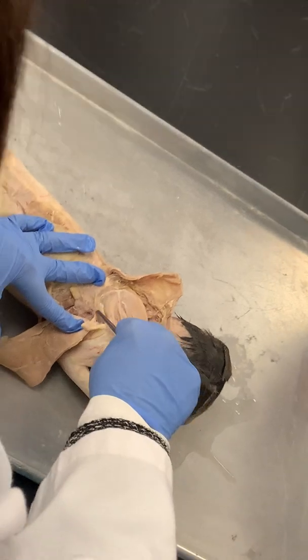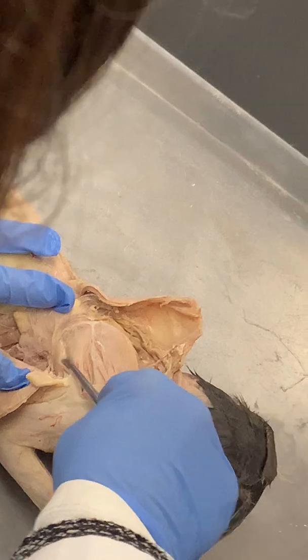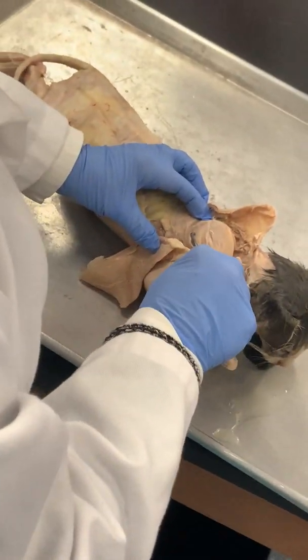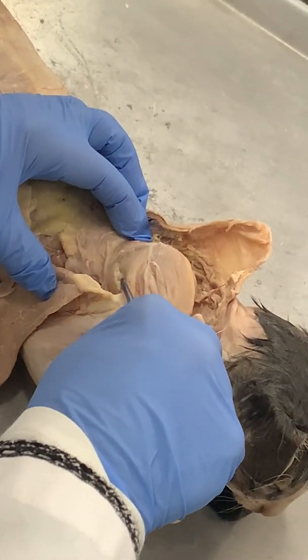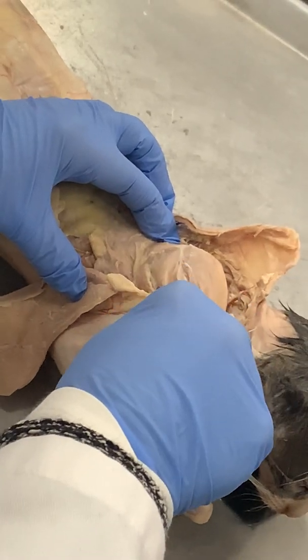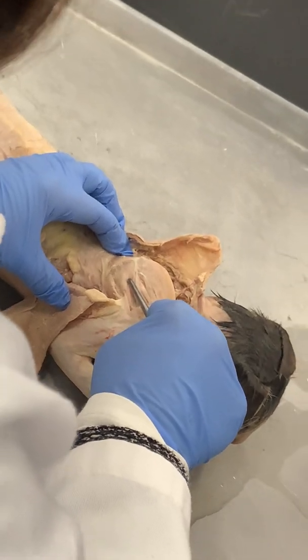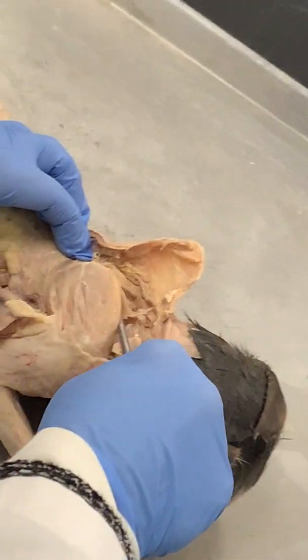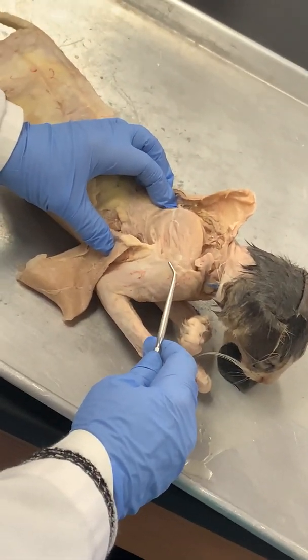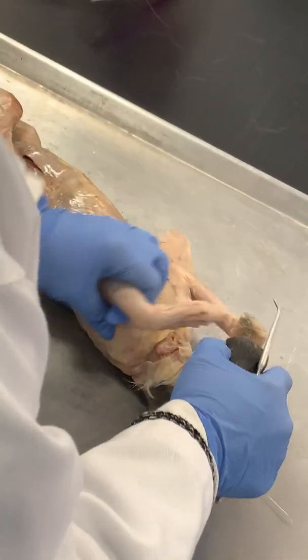If I separate it out — do you see that? The big one: teres major — they usually pin those on the models. Teres minor is right deep in there, it's hard to see. It's right here basically — that's teres minor. Infraspinatus, supraspinatus, and subscapularis are all rotator cuff muscles — those four. Teres major is not one of the rotators.